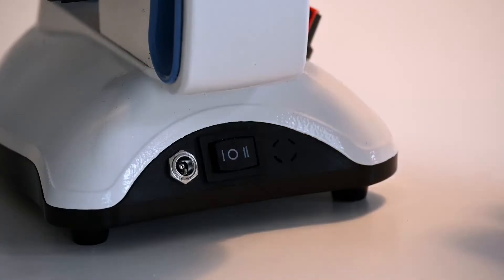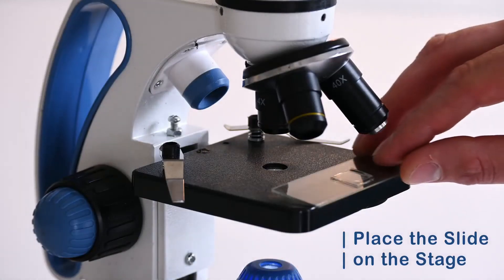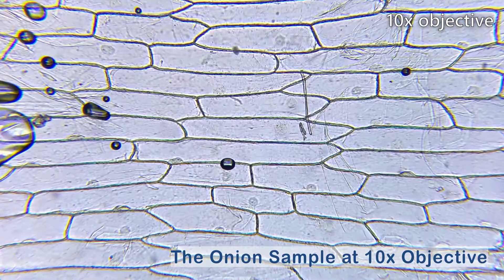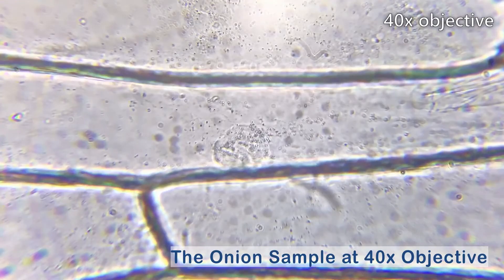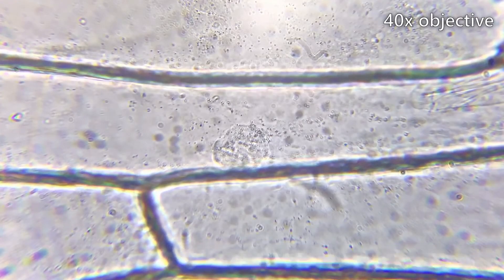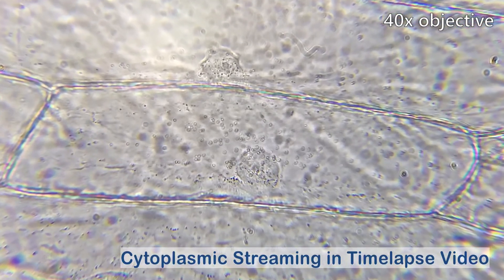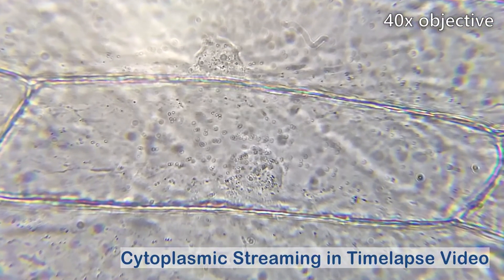Now we turn on the OldTed microscope and add the slide with the sample. Each box is an individual plant cell with its cell wall. Inside each cell is a large round structure — that's the nucleus, holding the cell's DNA. If you look closely, you can see tiny structures being transported around inside the cell. This is called cytoplasmic streaming, and it looks amazing in time-lapse video.